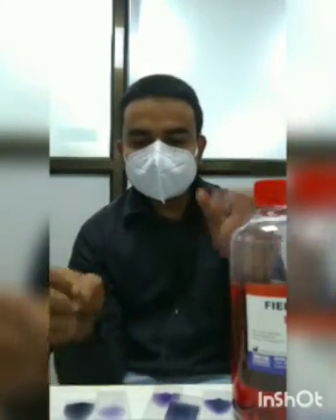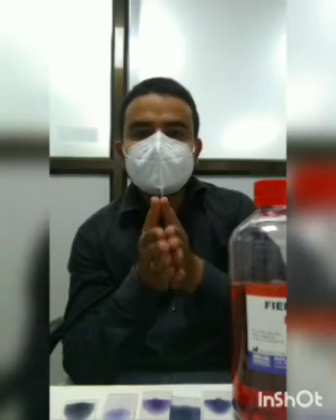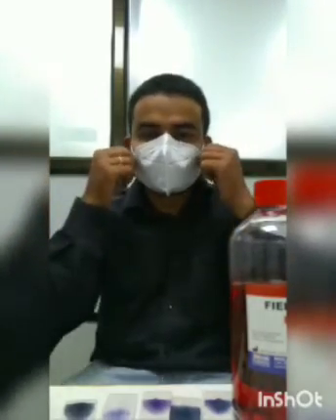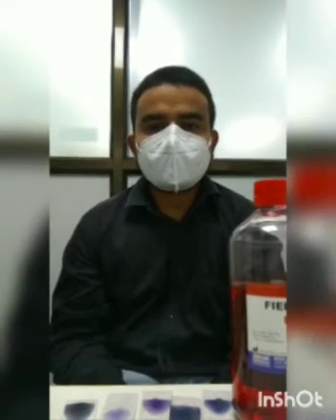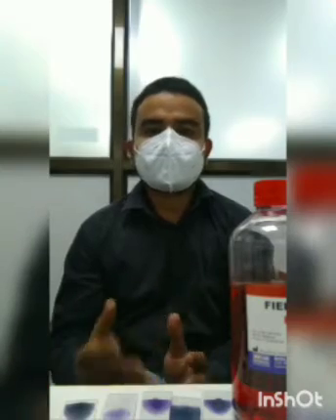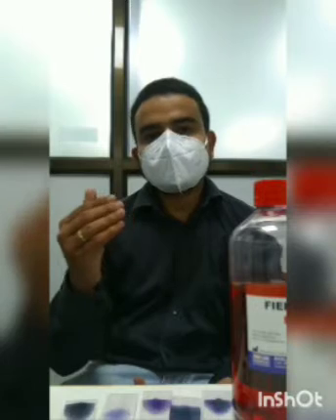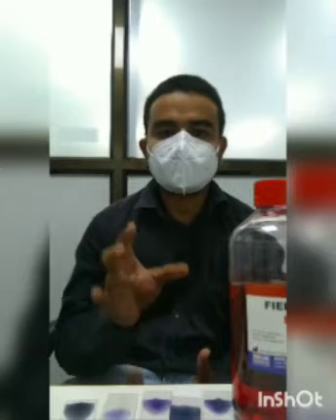Now basically what is happening, after preparation of the smear, we are fixing it by dipping these smears into 100% methanol or ethyl alcohol. Okay, you keep it for 2 to 5 minutes for a proper fixation. If it is a humid environment, take care that we have to replace the methanol 2 to 3 times per day, because there will be some dilution happening slowly of the methanol, that is 100%.